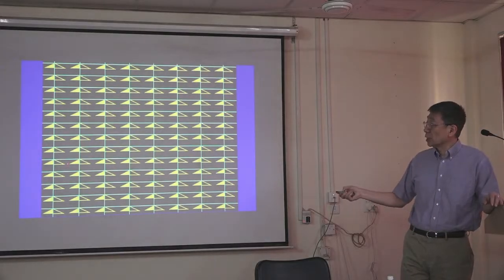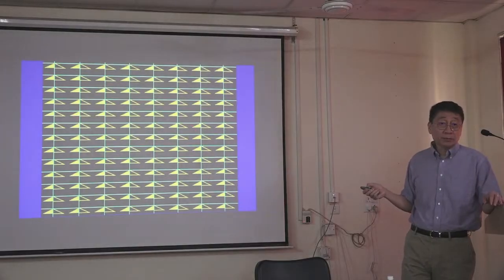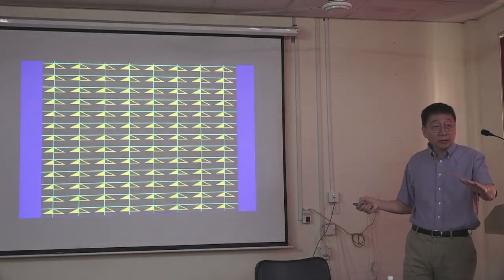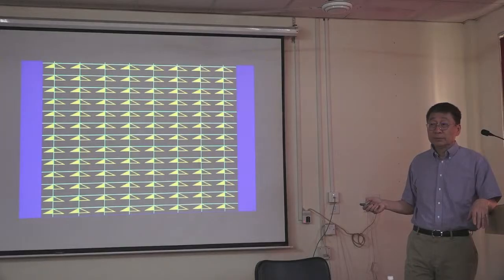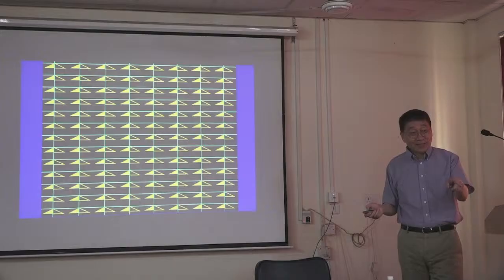So that's the lattice, and then you have a content in the unit cell. The molecule is the content. The lattice is how the molecules are arranged in space. So that's a crystal. And because of this regular repeating pattern, you get sharp faces, sharp edges in your crystal. Okay? Is that a yes? That's a yes, right?